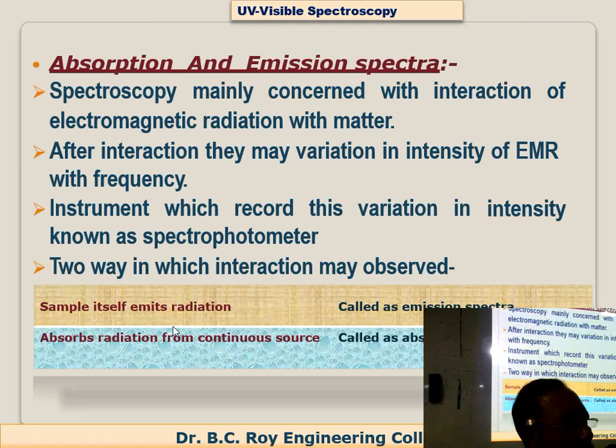Spectroscopy is the scopy. When you are using the term spectroscopy, it means a total type of discussion. Spectrogram, that is the photograph. Spectrophotometer, the machine. All are very close but not the same. Spectrum or spectrogram, that is the picture, the plot, the graph that is found, the final output. Spectroscopy is the theory, our discussion. And spectrophotometer is the machine where we are doing the analysis.